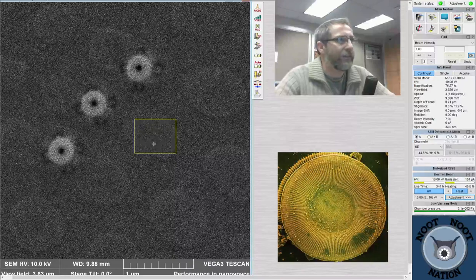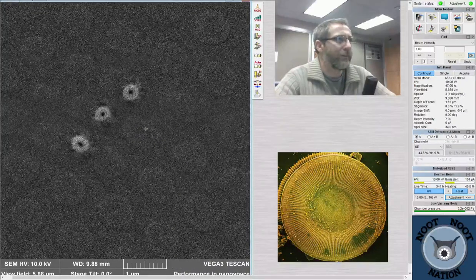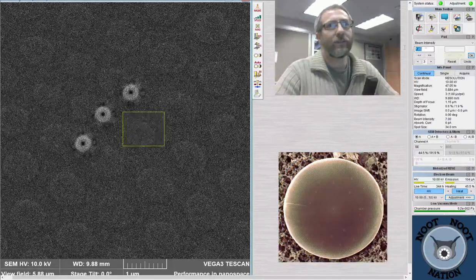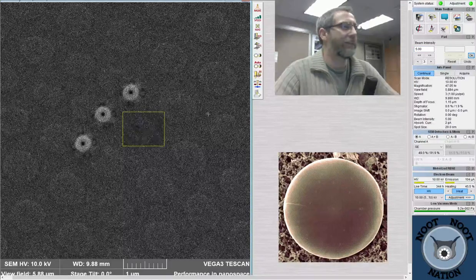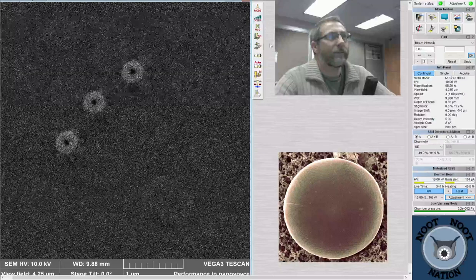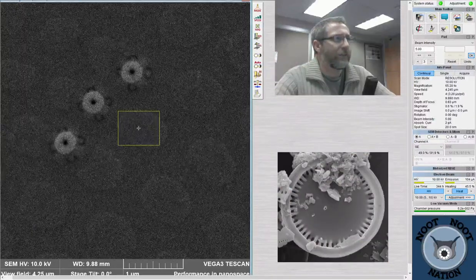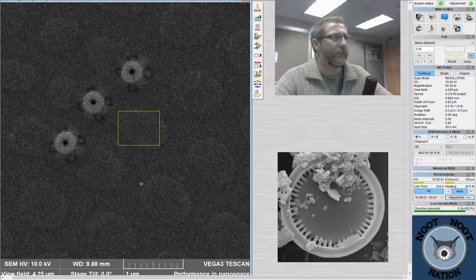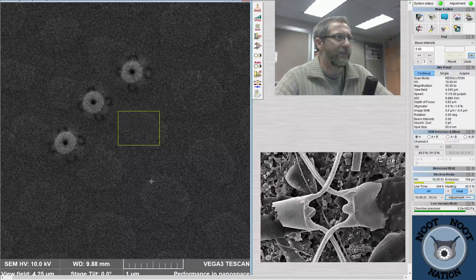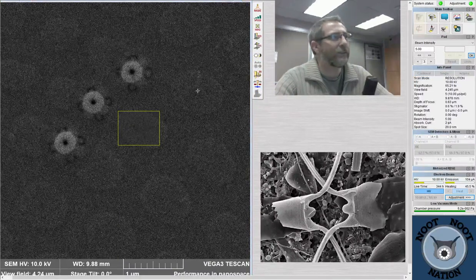So it's a characteristic for the species, typically, not the genus. And I'm just going to see if I can kind of tweak this image a little bit, so it's not quite so fuzzy. And to do that, I'm going to lower my beam intensity down even a little further and slow down the speed and try to just zoom in on one of these boxes a bit. And oh, it's really kind of challenging because it's dark, so I'm going to work on that as well.